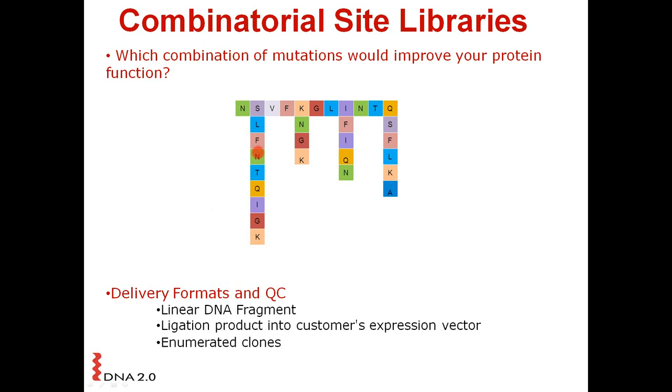And of course, if you choose, you can diversify these using the same ambiguity that you saw before, the NNN or the NNK. You can also call out specific amino acids, specific codons that you want to substitute as the pattern here, where in some cases you're only substituting in 3 different amino acids or codons, and in other cases you're using large numbers up to 18 to 20. The diversity that you receive in a library like this can rapidly grow to very large numbers, and that's something that you want to pay attention to as you think about doing the designs for these libraries.